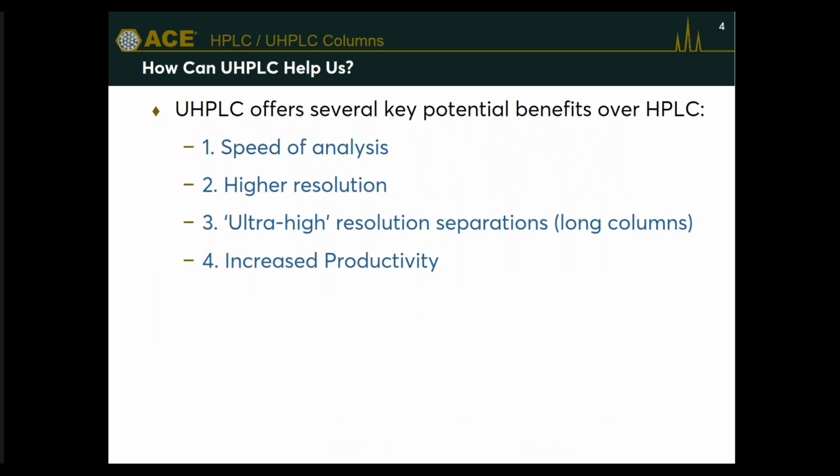So UHPLC offers us a number of different advantages over HPLC, and I've listed 4 of those advantages here, which I'm going to briefly touch on to begin this talk. There is the speed of analysis and the opportunity that we can do things much faster. There's higher resolution, potentially with smaller particles.